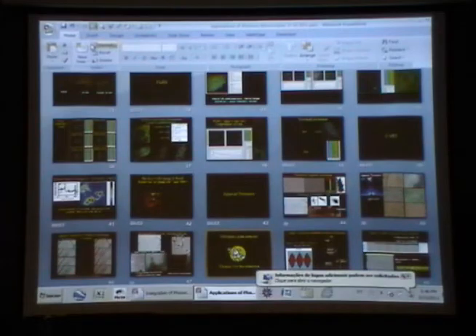We also bought a system that they call spinning disk. Spinning disk is very fast. It can take images at a frame rate of 100 frames per second, but only fluorescence and wide field. It's not a focused scanning laser. With spinning disk, we're going to be able to see some of this, but not in the same situation we have here. Although Sunney Xie, the pioneer of CARS, did show video rate CARS images. CARS can be quite fast if your detectors are very sensitive.